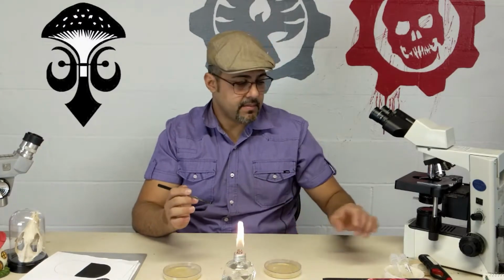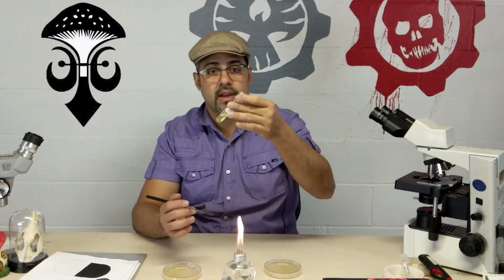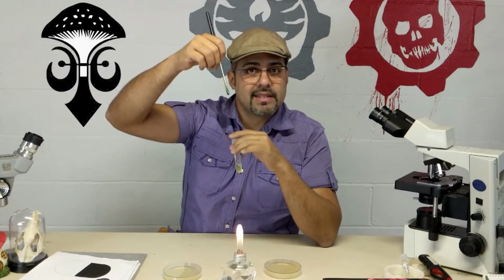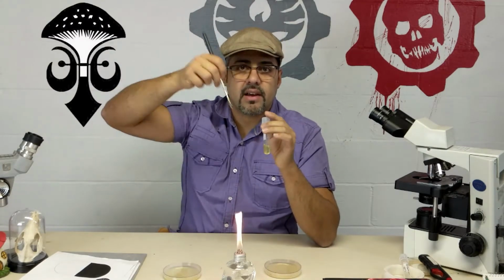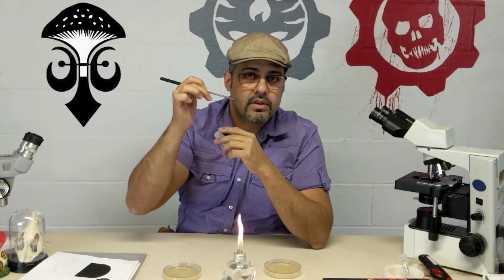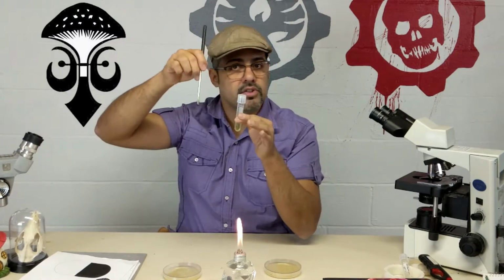It is the same thing if you're going, let's say, from a broth or slant to a broth or slant. Now, when you're going to the broth, you pretty much just mix it inside the broth. Remove the bacteria and mix it inside the broth. When you're going from a slant, then you take a small portion of your bacteria, and if you're transferring to a broth, pretty much you just shake it.